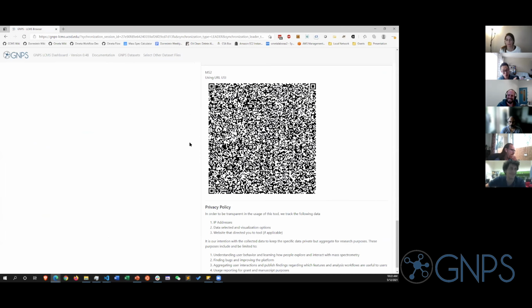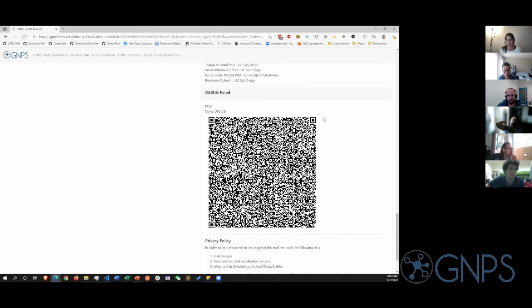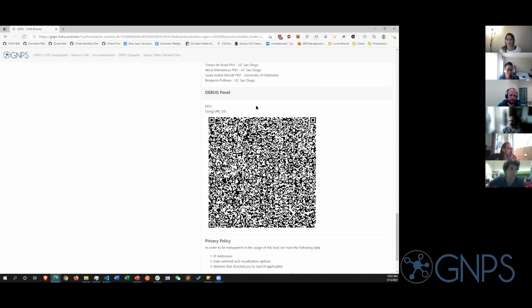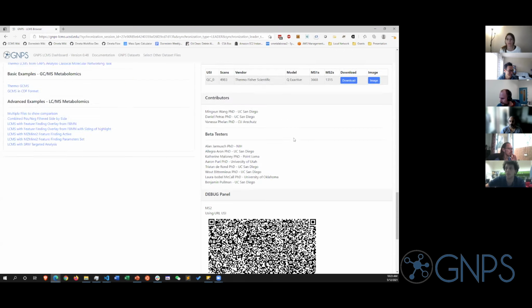But technically, if you have a talk or your ASMS posters, you can post it there and say, hey, use your phone, bring it up to it, and you can look at my data. I know some grad students and postdocs who are very proud of their data and want everybody to look at it. So this is a way to share it with the rest of the world.